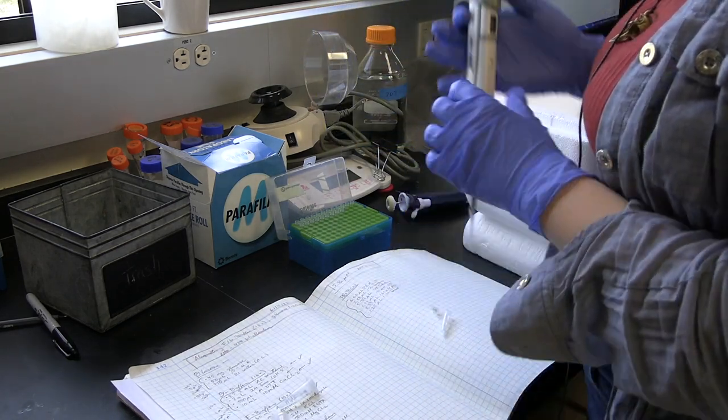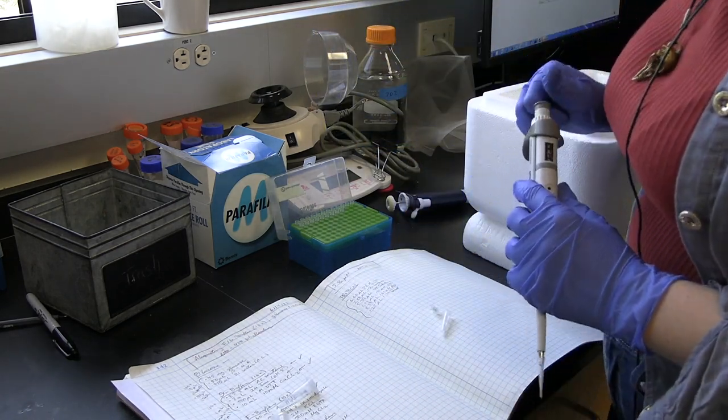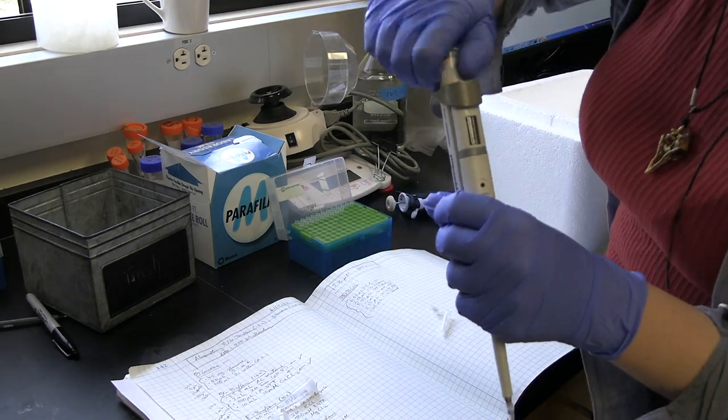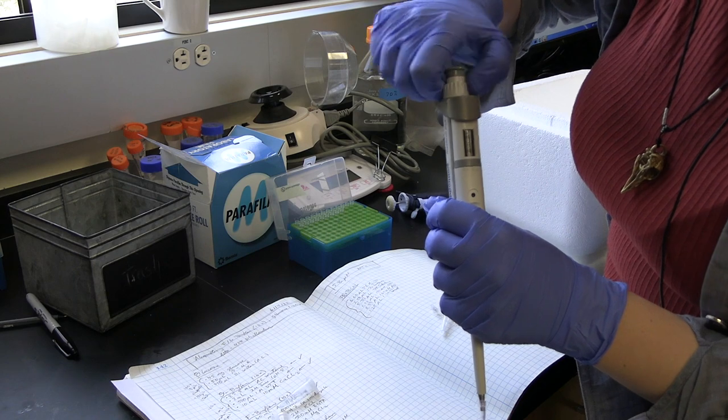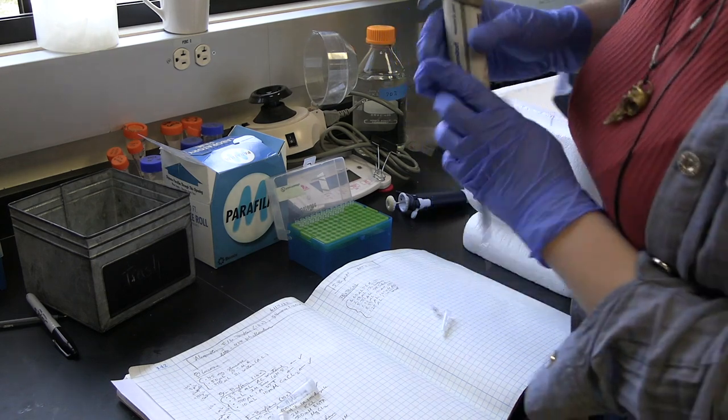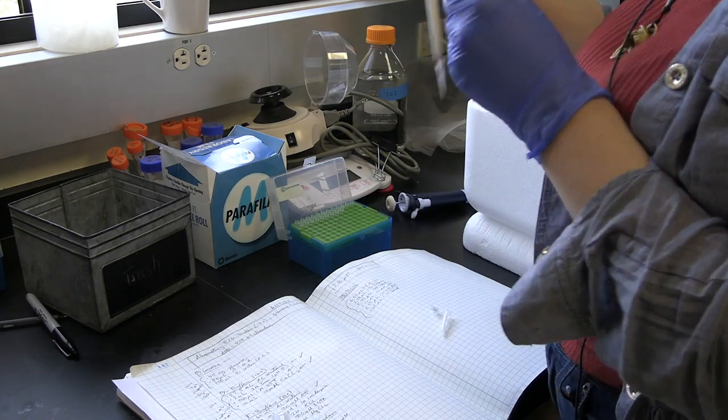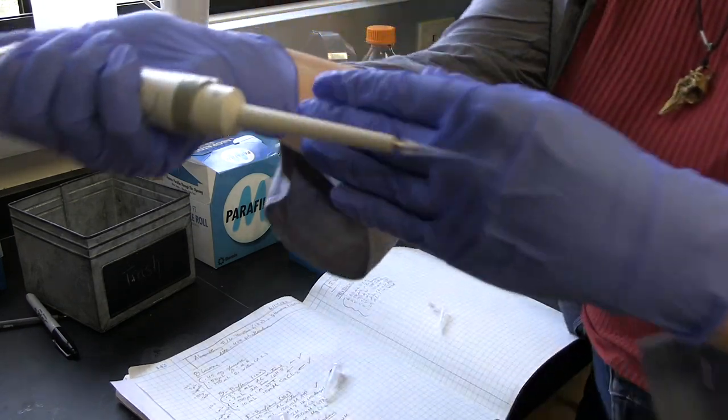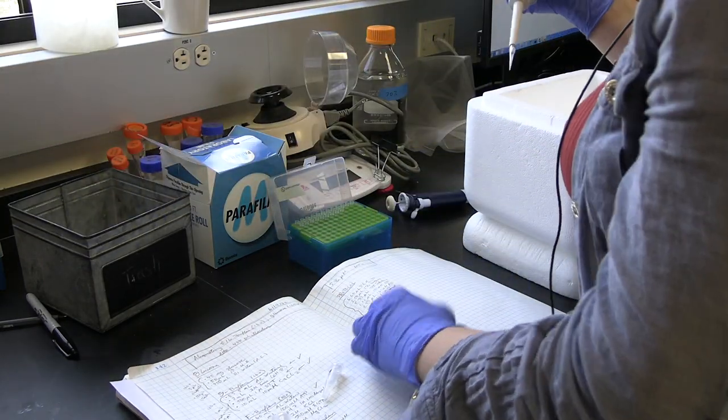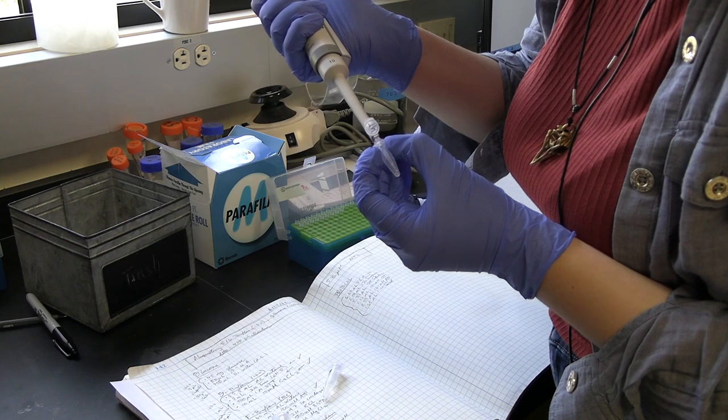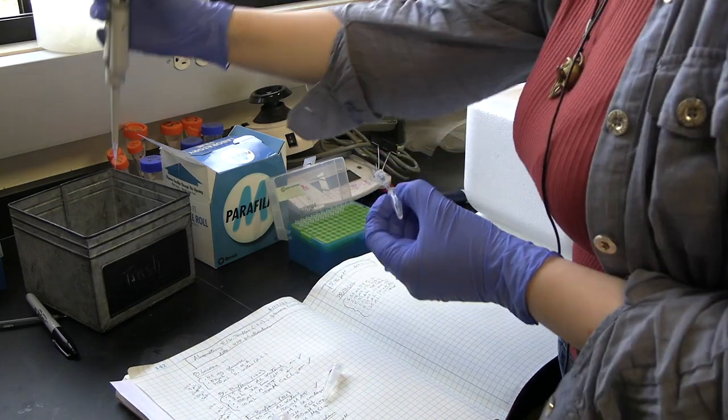Next thing we add is 1% tween. Tween is a surfactant that prevents nonspecific binding. 2.5 microliters. Add that right to our PEM.